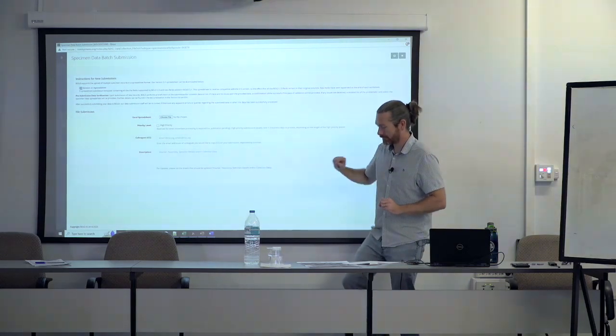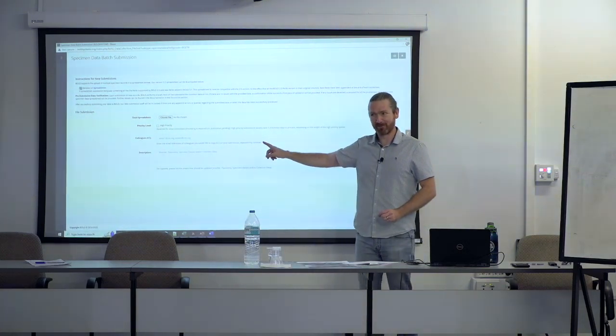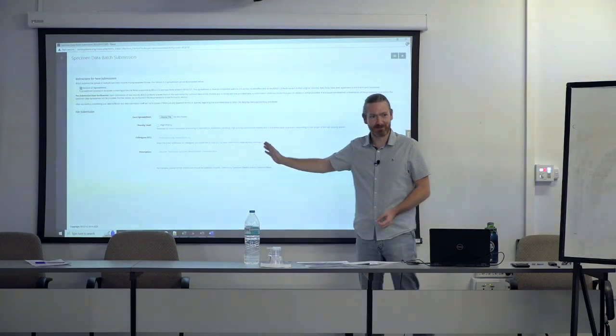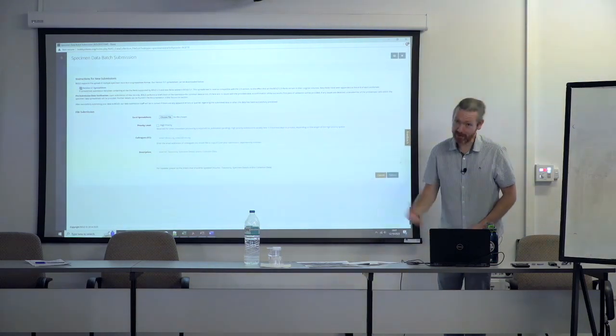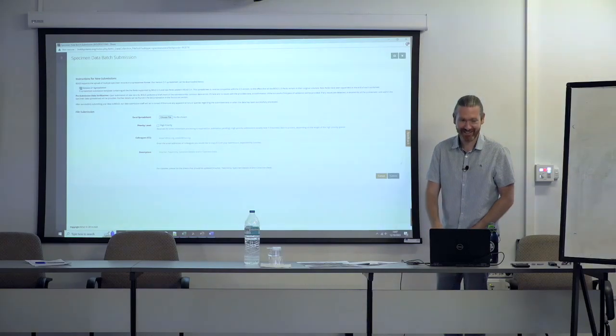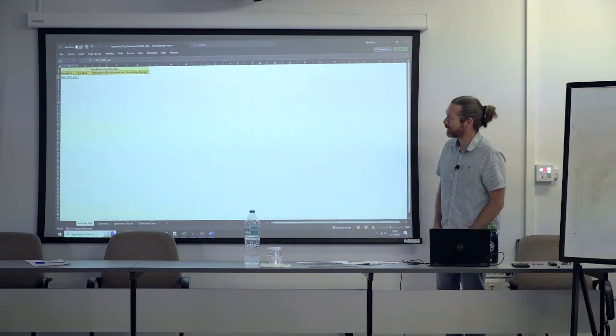If you tick the little priority level thing, I don't know if they pay attention to it, but when I do tick that, it does get uploaded within 8 hours. It's just brilliant. So yeah, always tick the high priority one, because the people not ticking it just go down the list, right? So anyway, they're probably going to see this and never, ever upload anything of mine again.